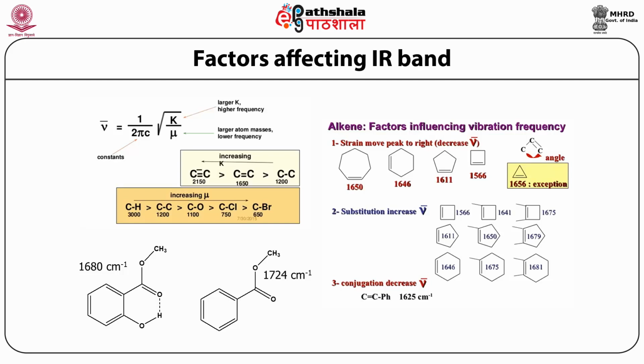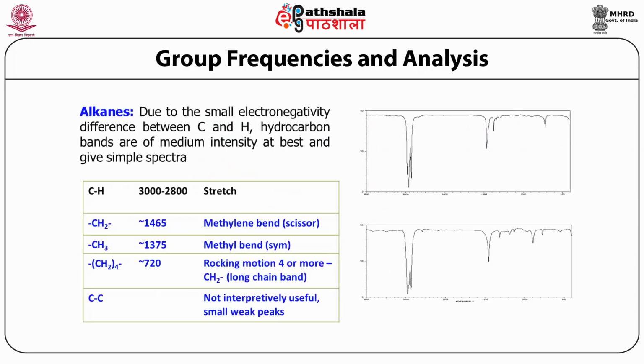As we increase the substitution, the frequency increases. You can see this in many examples. And conjugation decreases the frequency. As we increase the conjugation, a decrease in frequency is observed. Here we discuss the group frequencies and their analysis.